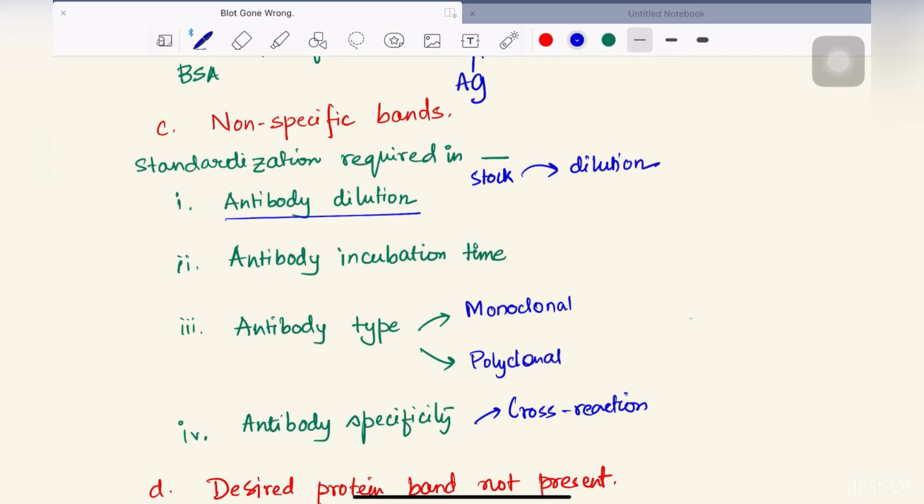We can dilute the antibody in this way, like 1:500 dilution, 1:1000, 1:5000, and so on. Along with your antibody, there will come a technical sheet, where it will be mentioned how much dilution is usually preferred for blots if you're using whole cell lysates.